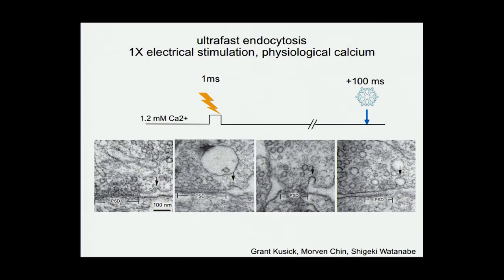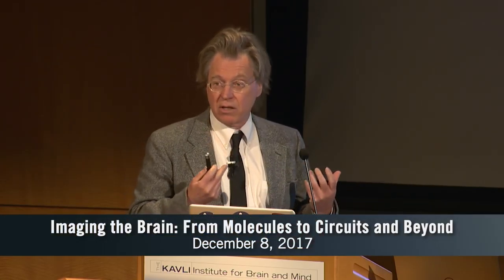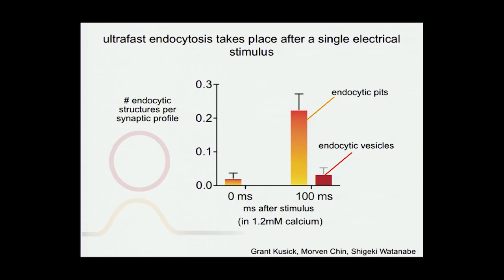And now again, here's the active zone, postsynaptic density is marked here, and here is an invagination, here is an invagination, and here's another invagination at the lateral edge of the active zone, once again showing that ultrafast endocytosis takes place even with electrical stimulation. So here's the quantitation of that. Here's an unstimulated sample, and here is a sample stimulated 100 milliseconds earlier, and we see the presence of these endocytic pits and endocytic vesicles.